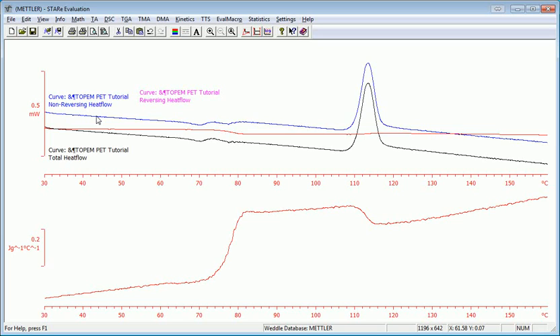So that's it. Then you can work with these curves like you would any other curve in the STAR software. You can calculate TGs. You can do peak integrations, etc. So that's how you separate the different heat flow components using Topham.